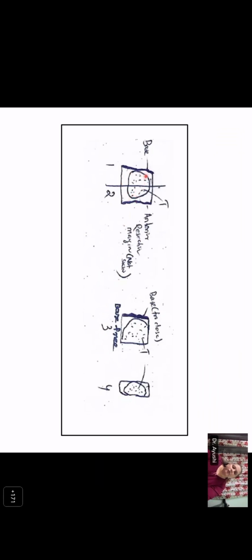So once we have examined the gross and taken the sections, making a grid diagram, we should identify the presence of margins in the diagram, and how close they are located as per our gross evaluation. And as I said, if some margin is very close to the tumor, then we can take more than one section from that margin, so that we can say whether it is involving the margin.